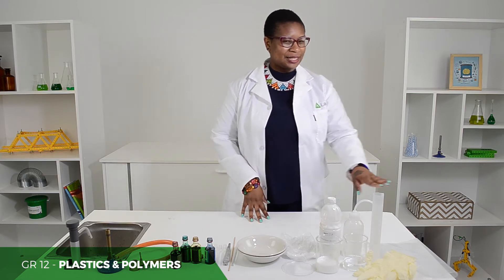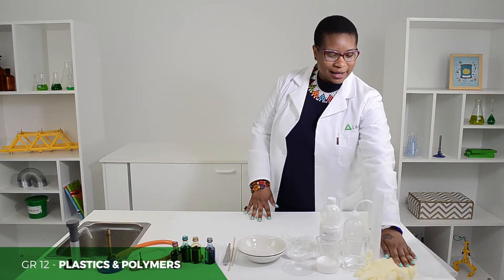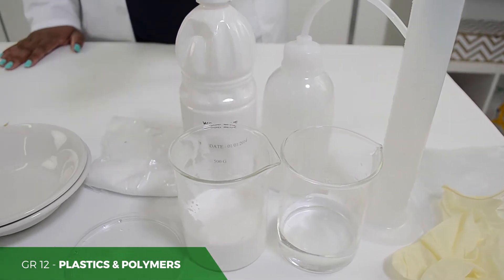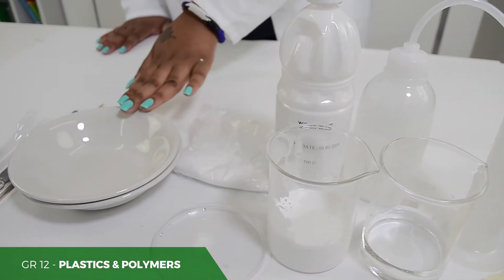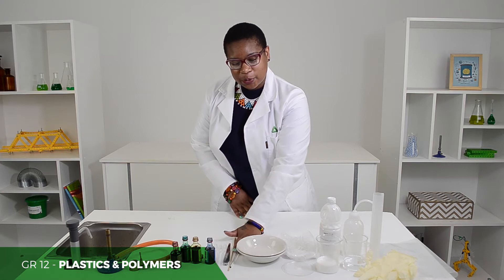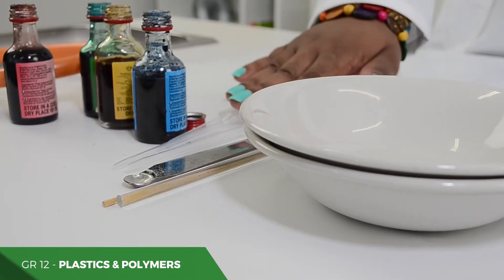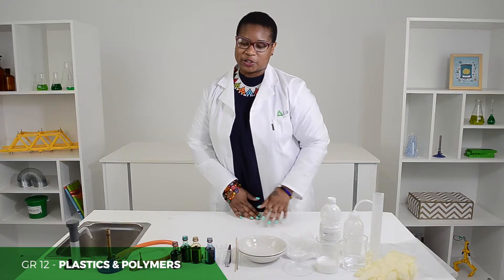What do you need? Plastic, gloves, measuring cylinder, water, beakers, wood glue, borics you mix in containers, your stirring rod, spatula, your droppers, and food colouring which is optional.